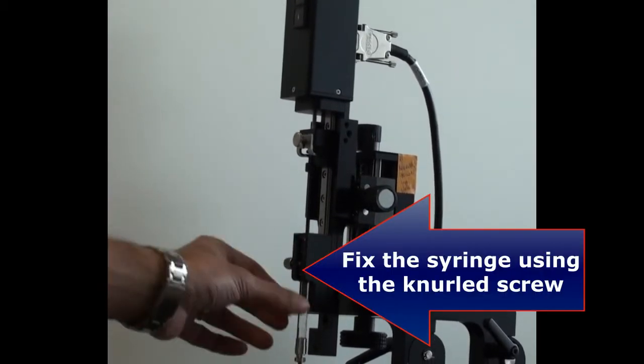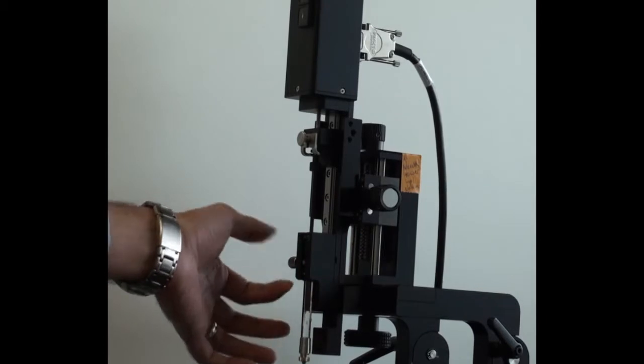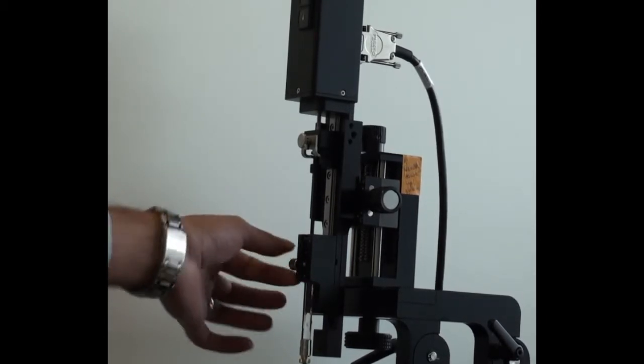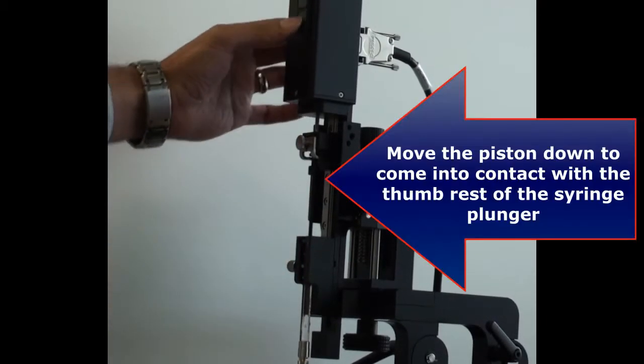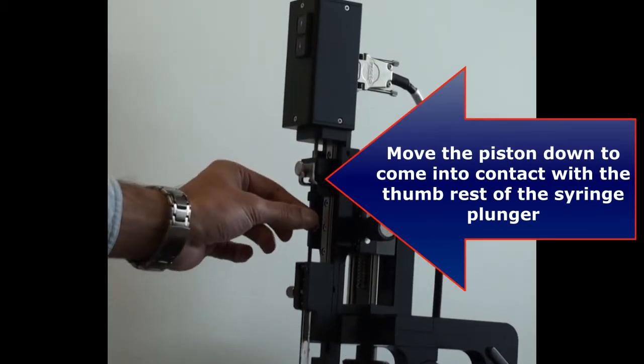Once the syringe is inside its designated place, secure the syringe using the securing nut and lower the plunger holder down to come into contact with the plunger.